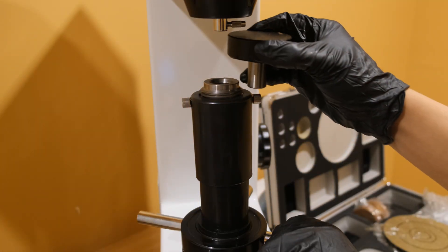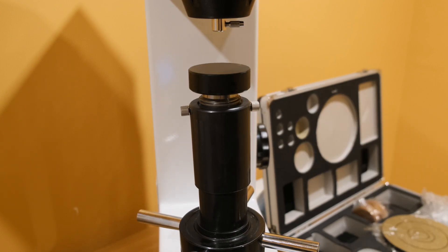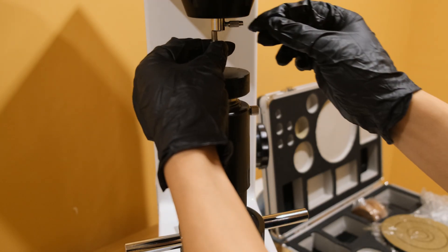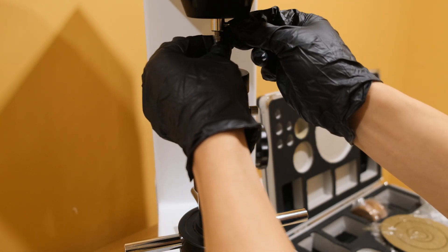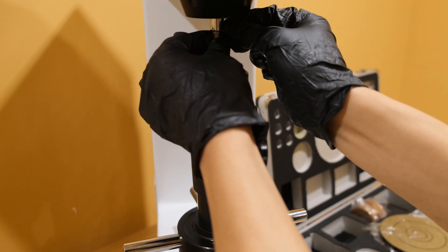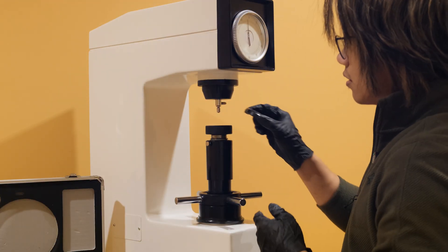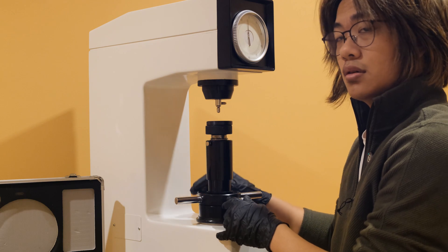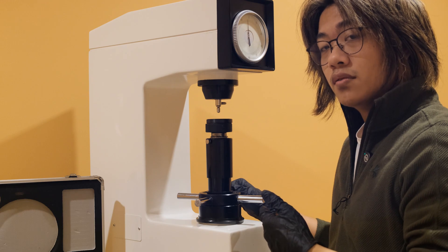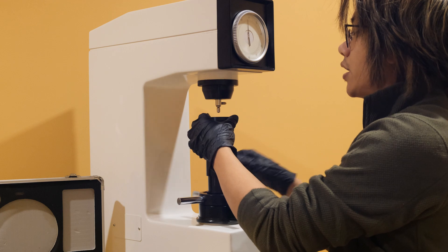Mount the penetrator and anvil, taking care to adjust the elevation screw as needed. Place the sample and verify that it is stable. This is vital to ensure consistency in your results.